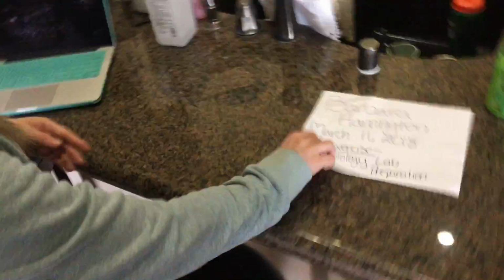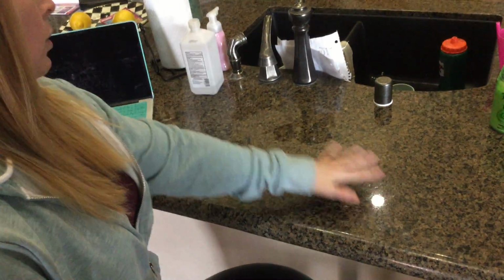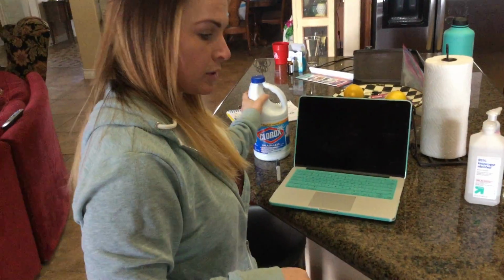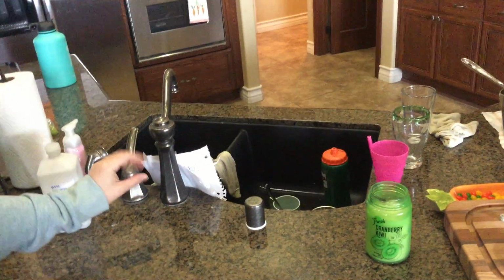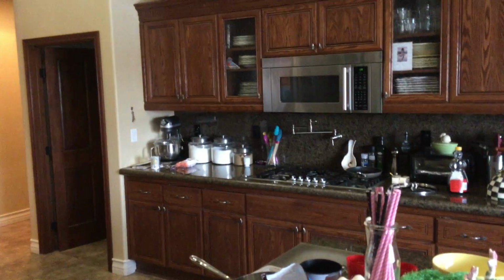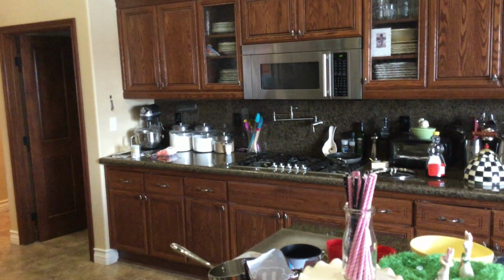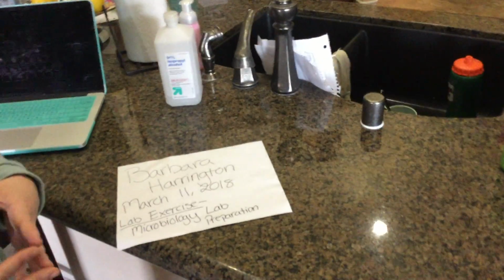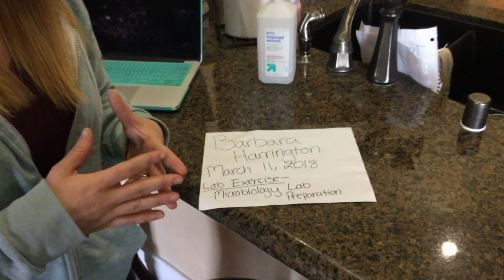So first off, I chose my site of where I'm going to be doing my experiment. It's in the kitchen. Before I perform my experiment, I'm going to clean my area with isopropyl alcohol or make a 10% bleach solution. I'm also right by running water, which is good and sanitary. I also have access to the stove if needed, which I did need this week when I was boiling my agar solutions for my agar plates. And also a trash can is readily available after I clean up my area appropriately.